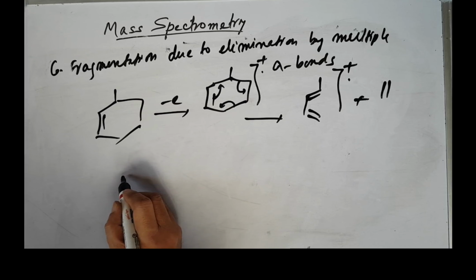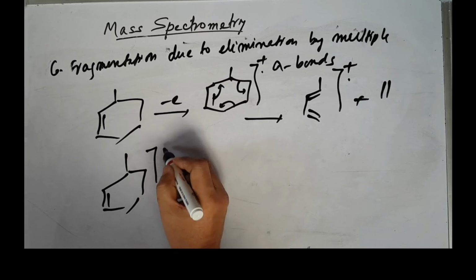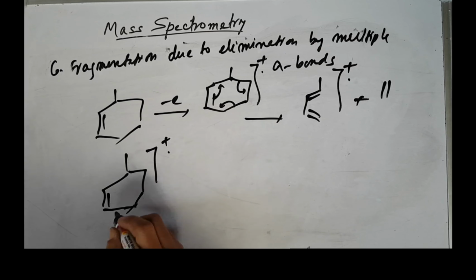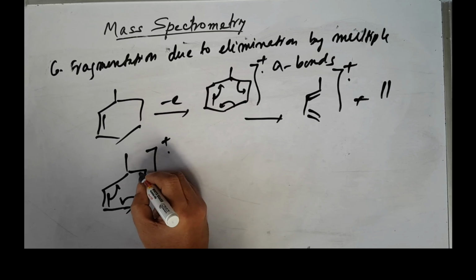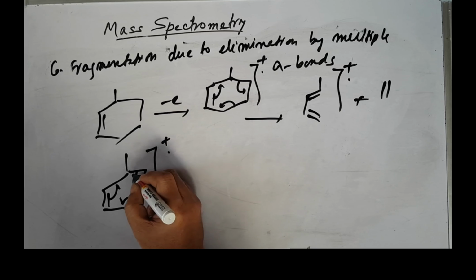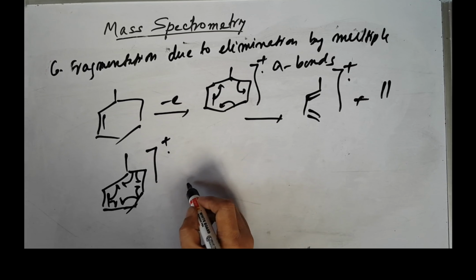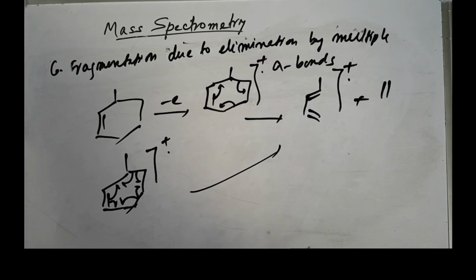But similarly you can also have a single electron movement. Okay, this is the molecular ion, this one. So a single electron movement can take place. This one goes, that is a double bond, and this also gives a double bond, and the other one like this. So it is the same product. Okay, but here is one electron movement and there two electron movement. So fragmentation takes place due to this. So today we will take up this, up to this much.